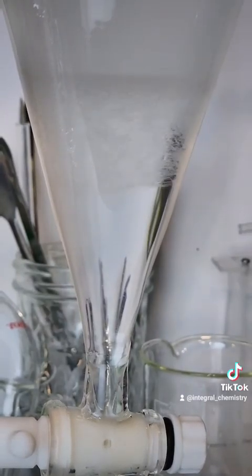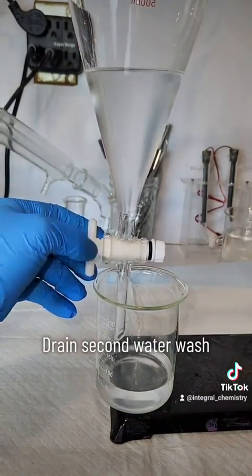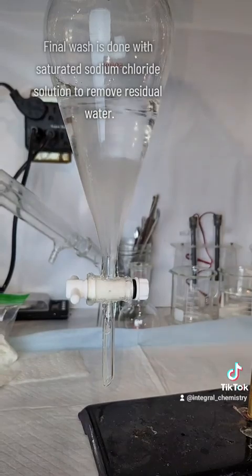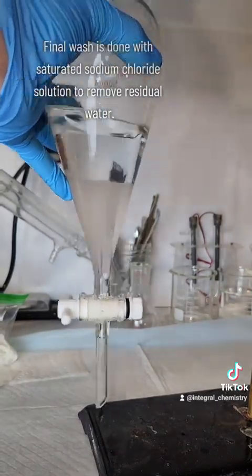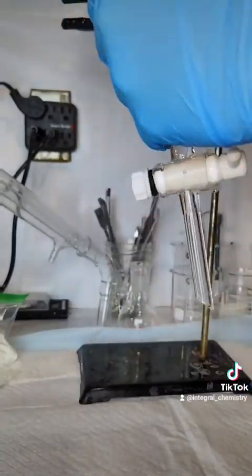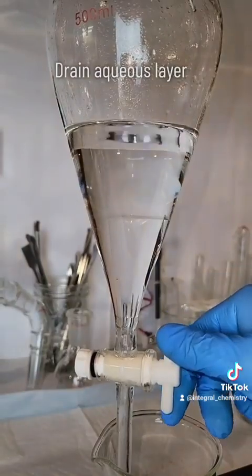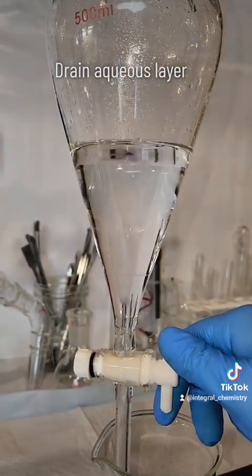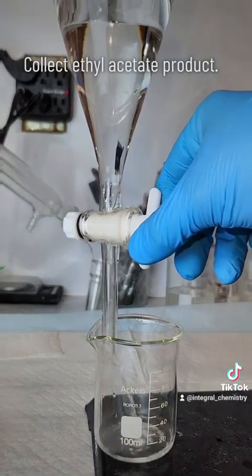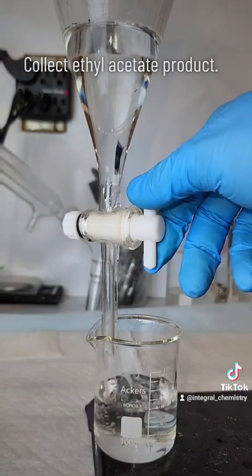In any case, looking back to our process here, I just finished my second water rinse and I'm going to do a final rinse with a saturated sodium chloride solution. This final wash will remove any residual water that might be dissolved in the ethyl acetate and leave us with a completely pure and mostly anhydrous ethyl acetate. A second distillation can be done at this point if you need a 100% pure product, but it's really not necessary. Once my sodium chloride aqueous layer is drained off, all I have to do is drain off and collect my ethyl acetate product.